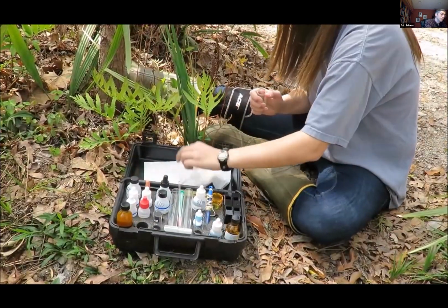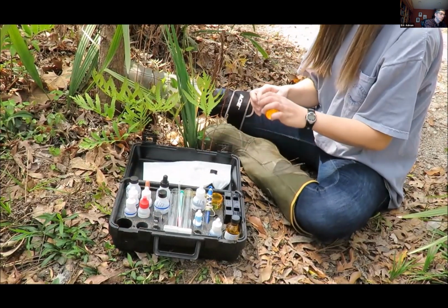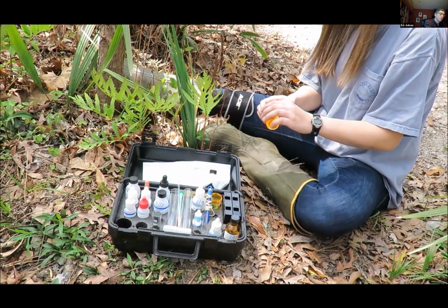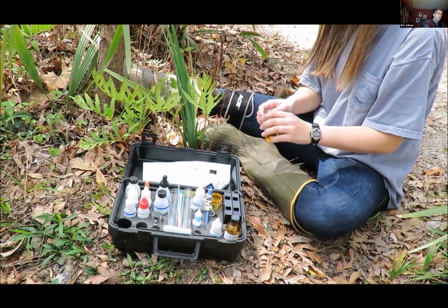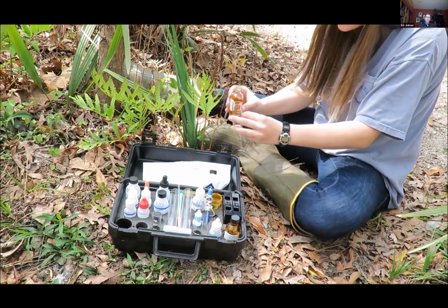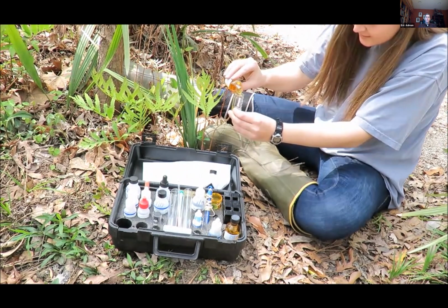Locate the titration tube in your kit. Rinse the tube 2 to 3 times with a small amount of the fixed sample from the first water sampling bottle. Waste can be put in a waste container or broadcasted in a vegetated area. Fill the titration tube to the 20 milliliter line with the same fixed sample.